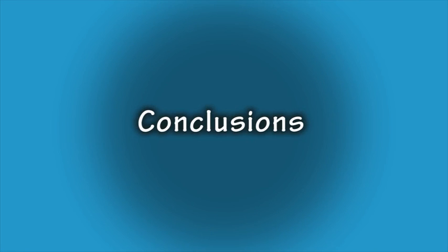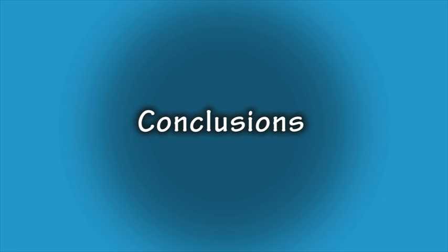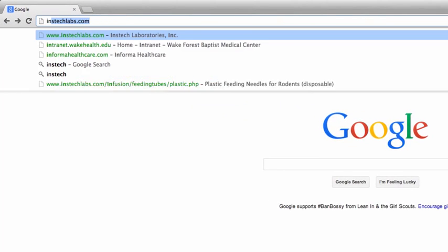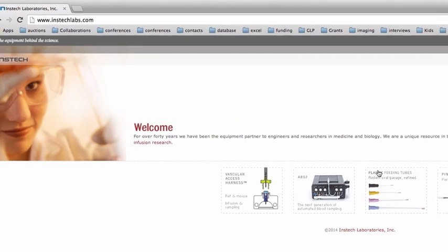In conclusion, for gavage, using a flexible feeding tube is preferred. These tubes are less likely to cause damage, are sterile and disposable, and these flexible feeding tubes directly support the three R's of research. Just as with any improved technology, there will be a slight learning curve when learning to use these flexible feeding tubes. When you are first starting out, try a variety of feeding tube sizes to find the one that works best for you. You can request a free sample pack from www.instechlabs.com.